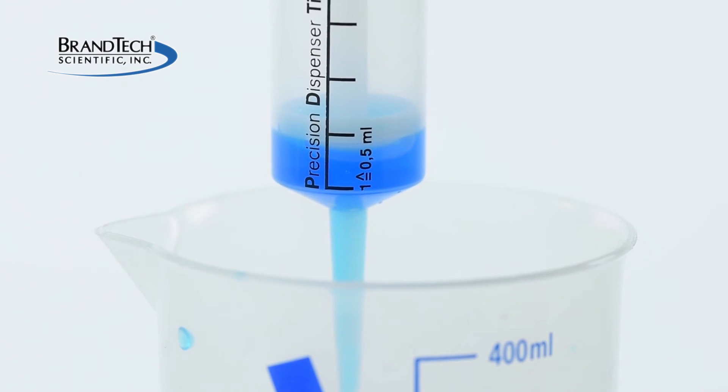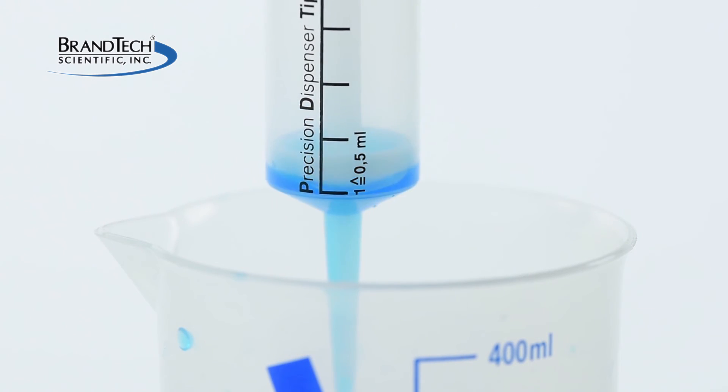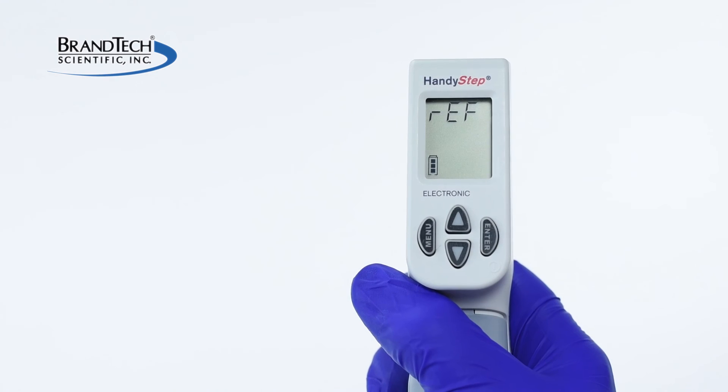The piston will move to the lowermost position, ejecting all residual liquid, and then make a reference movement to identify the tip size. The HandyStep is now ready to be used.